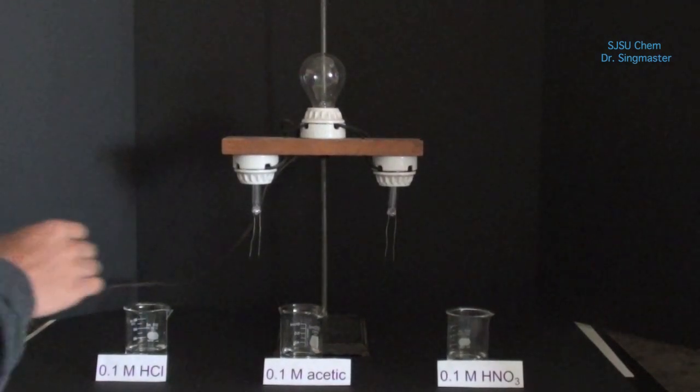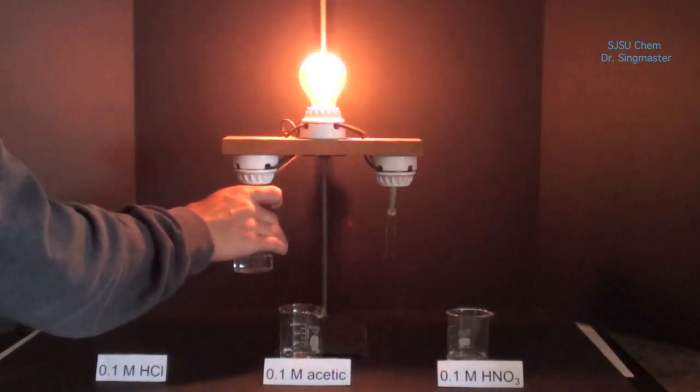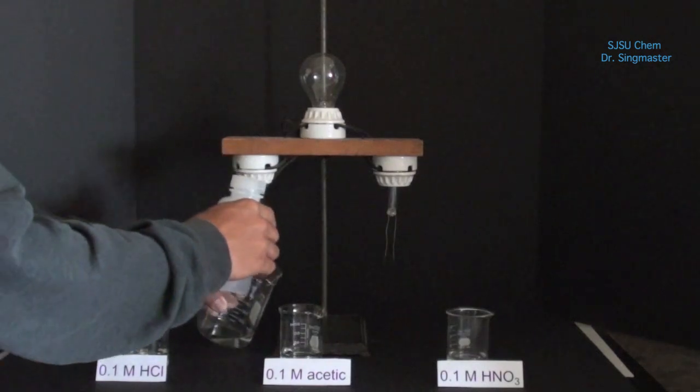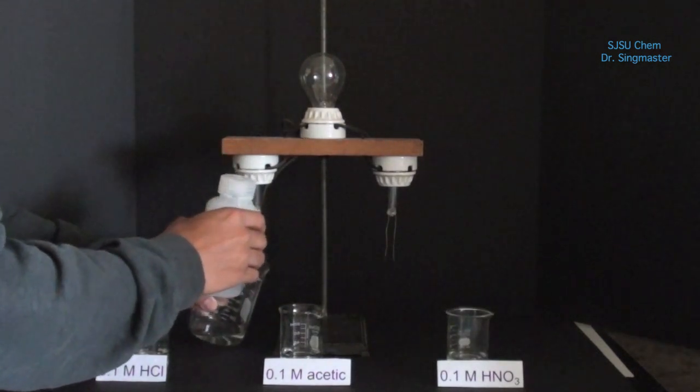We're now using a different conductivity meter, one that is a lot less sensitive. We're testing some hydrochloric acid. We then rinse the electrodes to remove the hydrochloric acid.